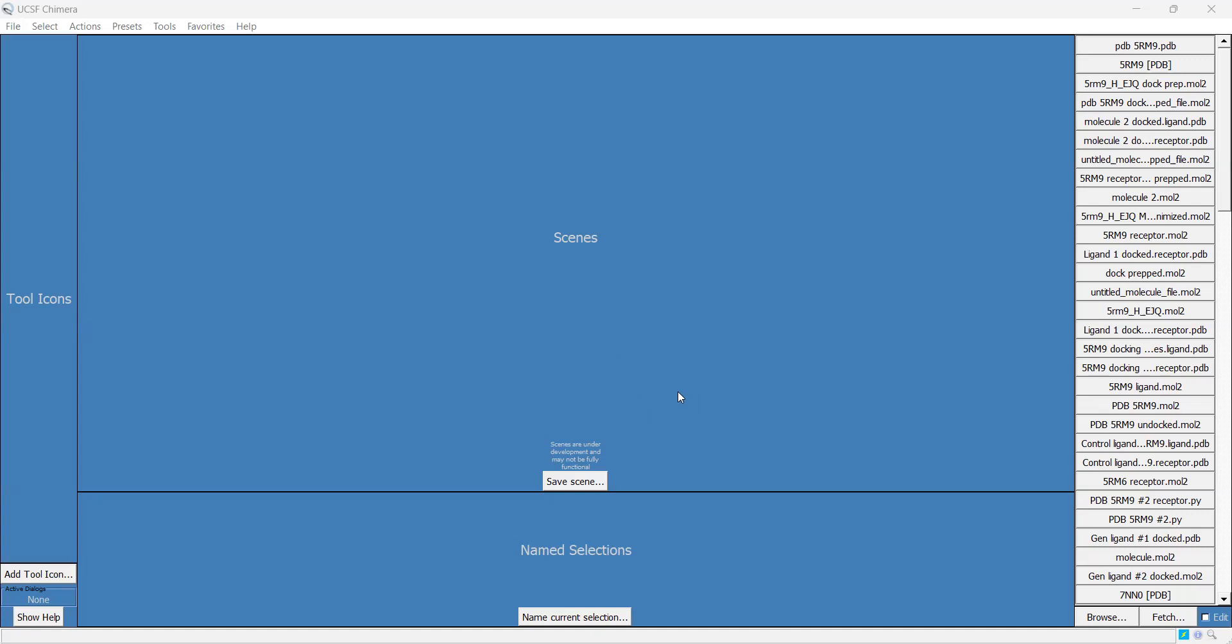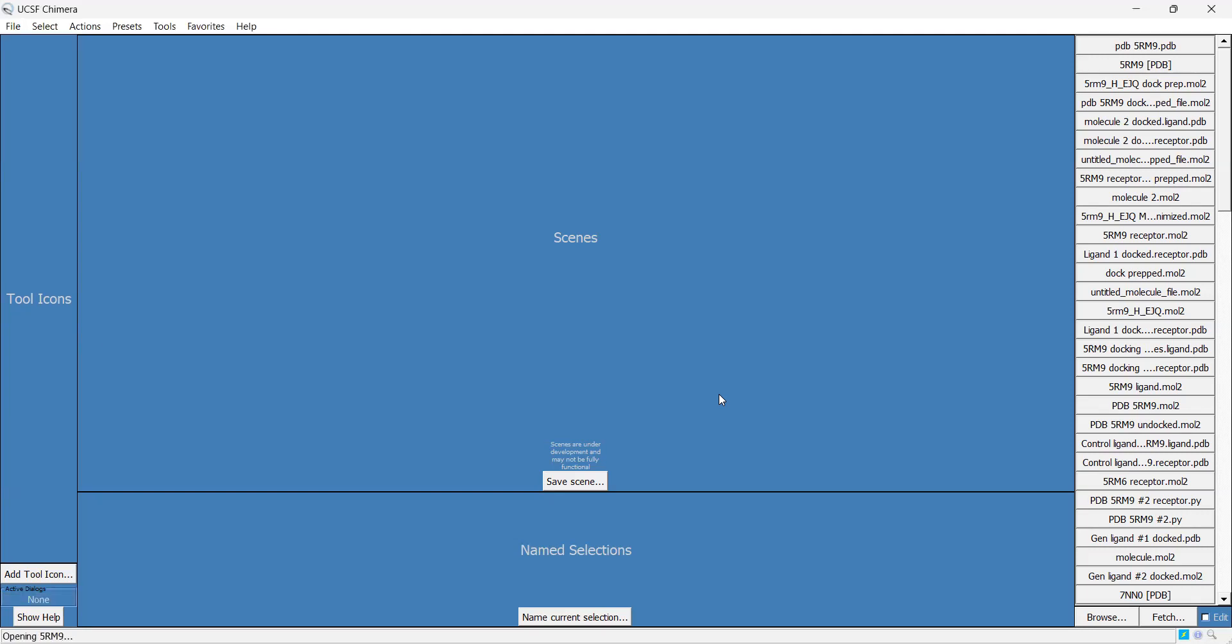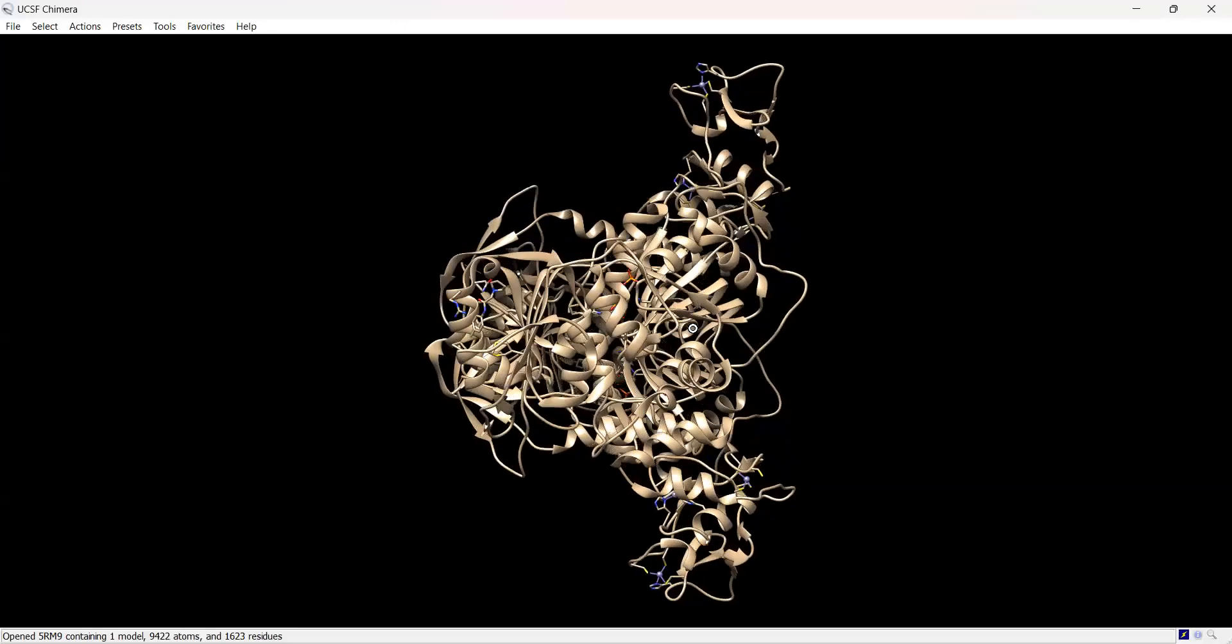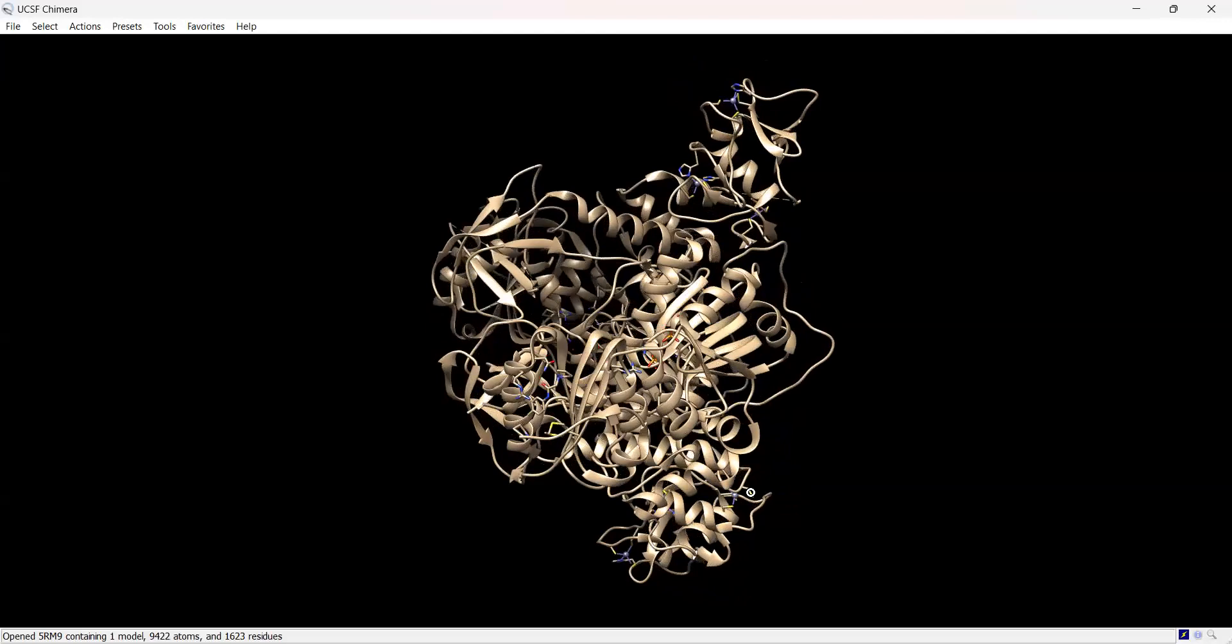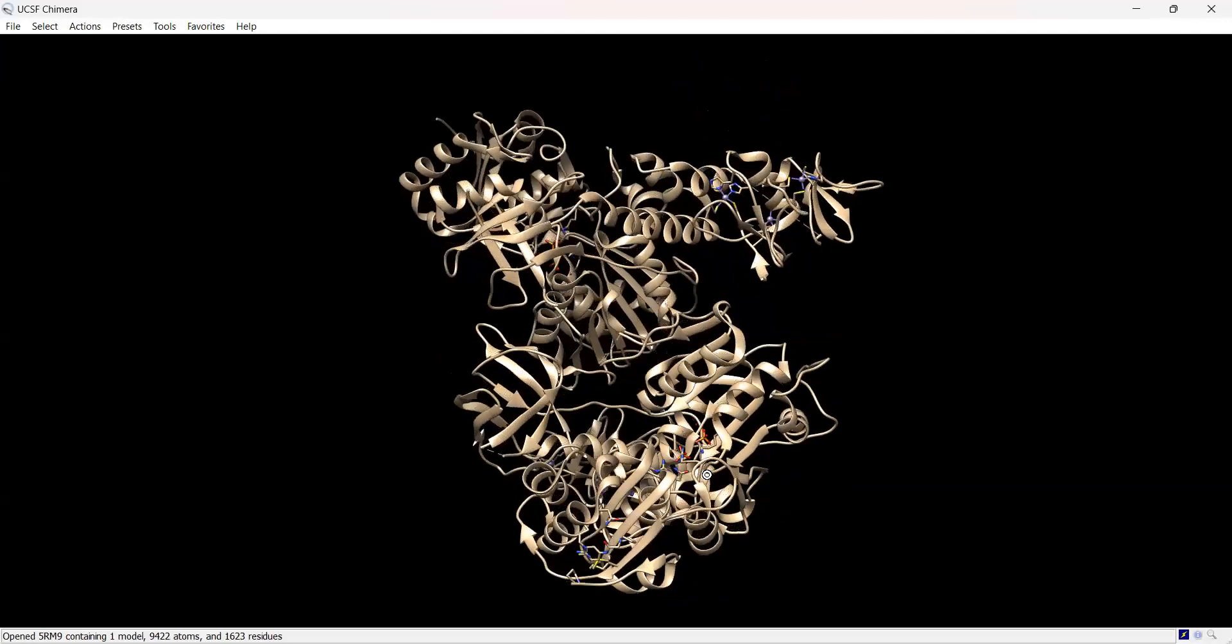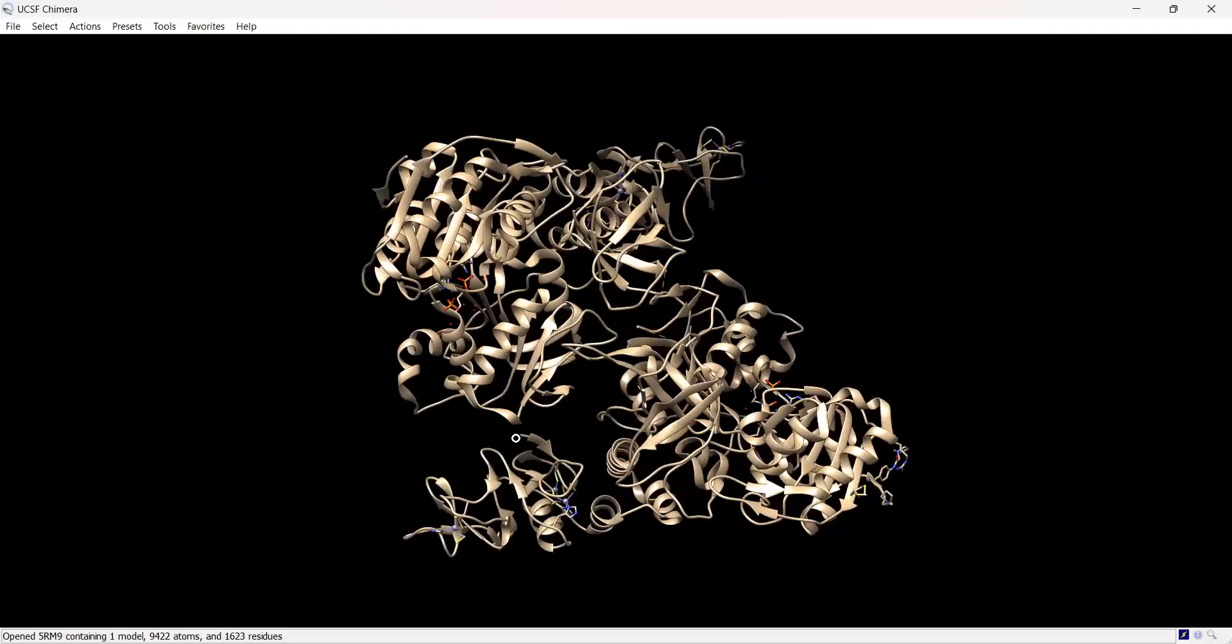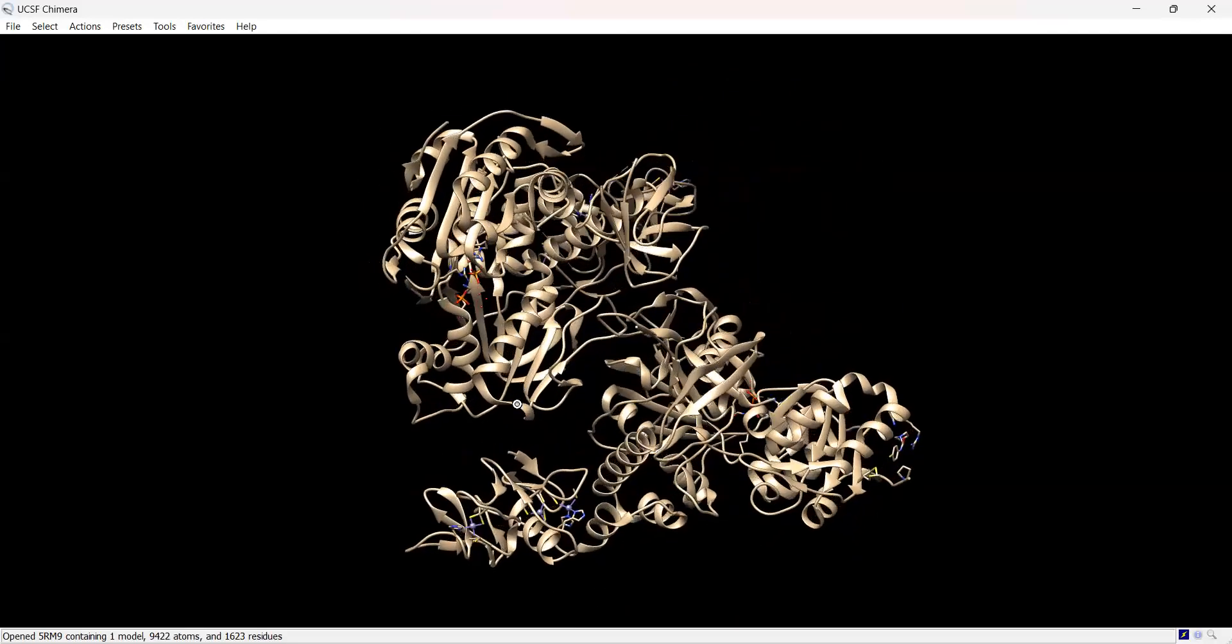First, we need to fetch the protein structure from the protein databank. Go down to fetch and type in the PDB code. You can search the PDB for your desired protein or target. I happen to know this one as 5RM9. Now we have the protein—two copies of the protein. This is a homodimer of the helicase.